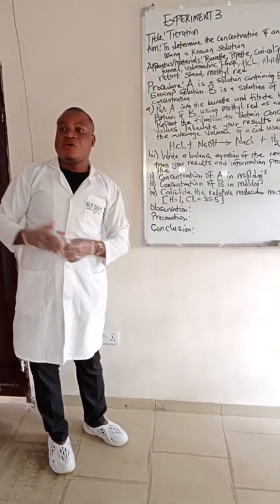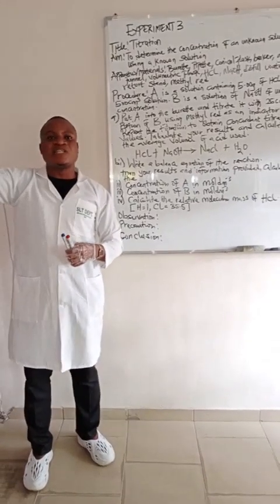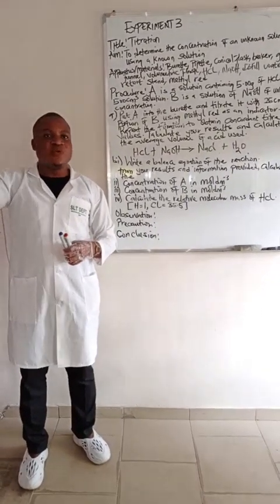Like one of the precautions: when you are using the burette, it's advisable for you to rinse it with water as well as the acid which the burette is going to hold.